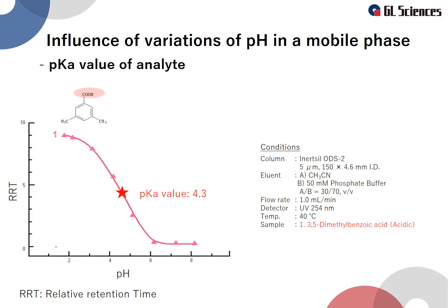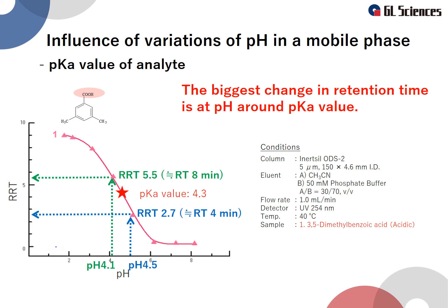Dimethylbenzoic acid is an acidic compound with a pKa of 4.3. As shown here, the retention time is longer under lower pH conditions. The biggest change in retention time happens when using a pH around the pKa value. In this example, when the pH is nearby the pKa value, the retention time differs by 4 minutes within a pH difference of only 0.4. This means that the retention time is not stable when the mobile phase pH is set near the pKa of the analyte.